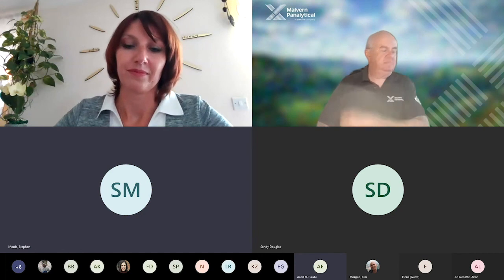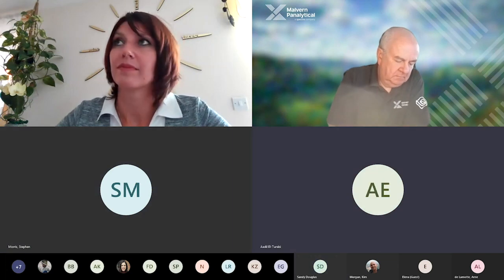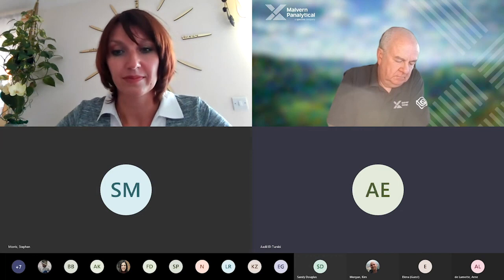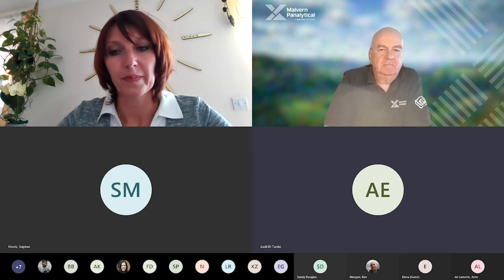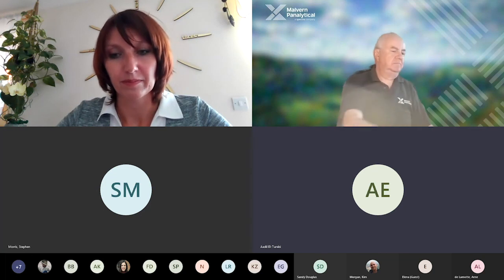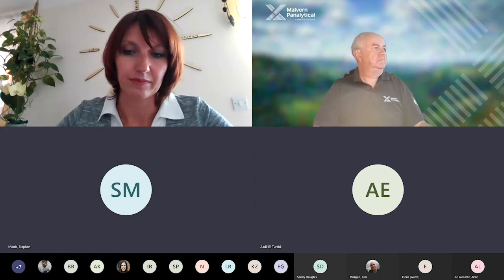Yeah. Hi, sorry, thanks, Steve. I'm interested to know more about the fluorescence mode in the NTA, and whether it's possible to look at more than one label at a time in a sample, or is it pretty much one-off? Could you, for example, do a nucleic acid stain and another antibody against a surface protein?